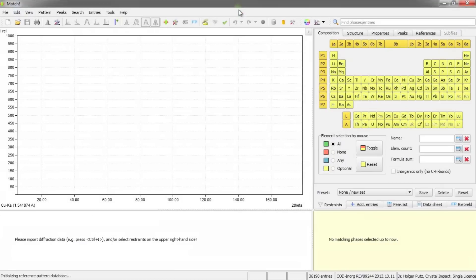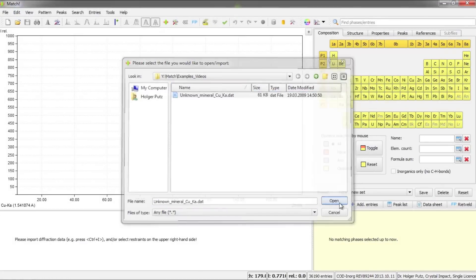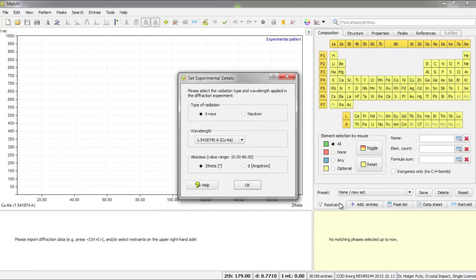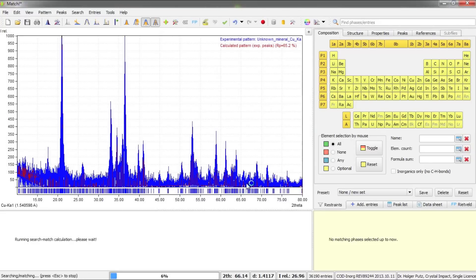First of all, I will run the MATCH software and import the diffraction data. I have to confirm the wavelength suggested by the program, which is copper K-alpha in this case. I'll press OK and now MATCH imports the raw diffraction data, performs an automatic raw data processing, and also runs a search-match calculation.